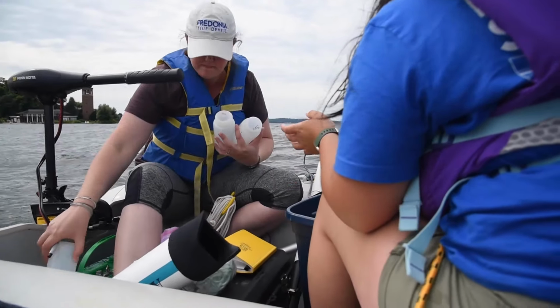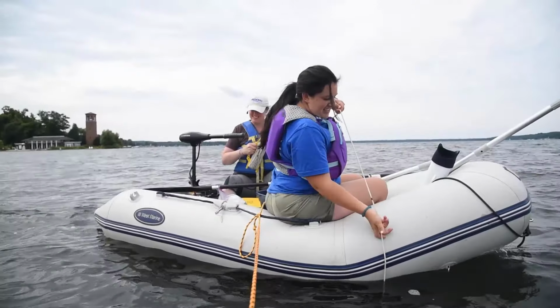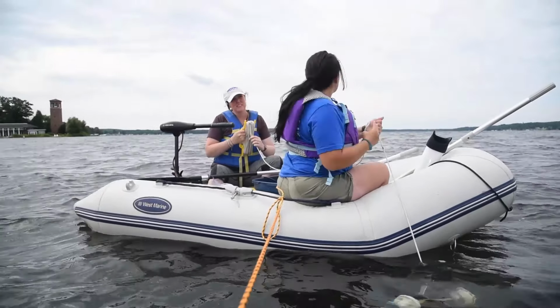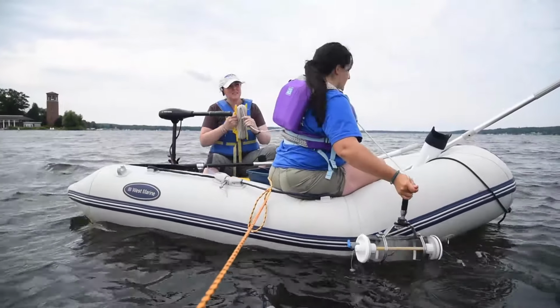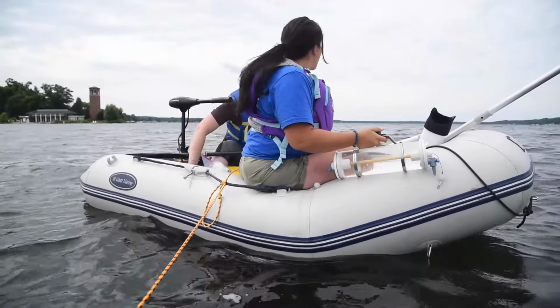So wherever that big chlorophyll spike is based on our vertical profile, we take our first Van Dorn sample. So the Van Dorn, we drop it down into the water, and then we pull it up and we're able to collect a water sample from 3 meters in the water column.